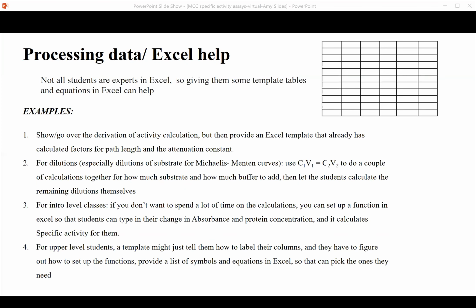Can I jump in and ask a question real quick? Yes, absolutely. Yeah, Jones here. Regarding the quantification of the malate dehydrogenase, we kept ours in imidazole after the elution, and when we ran a protein gel, we noticed that there were two distinct bands right on top of each other, one much fainter than the other.